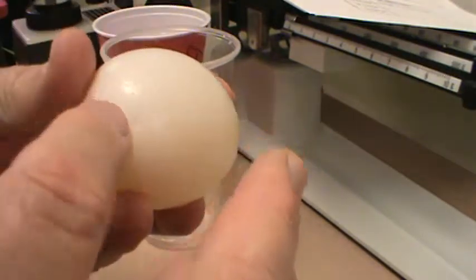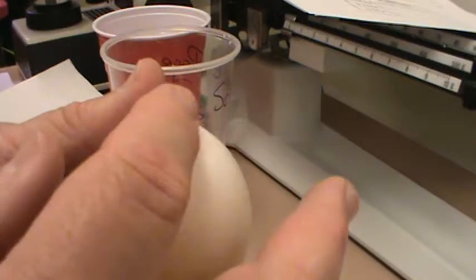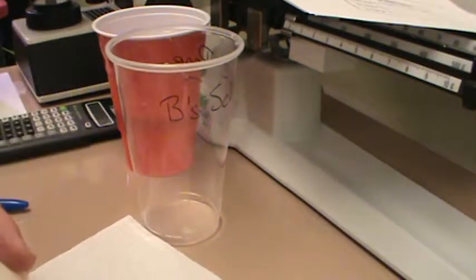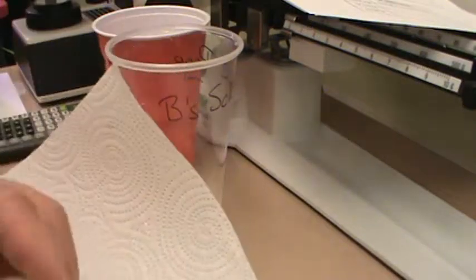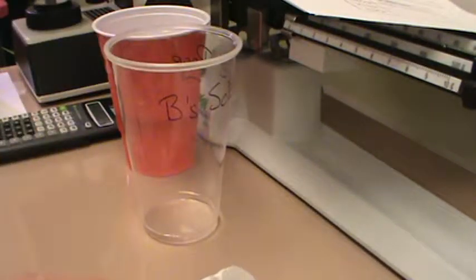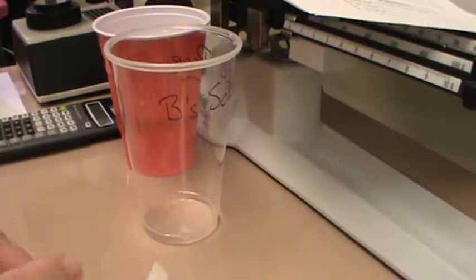Now, yesterday we still had this hard spot on the egg. I don't know if you can see that very well, but we have this nice hard spot where the shell never really did get off. Yesterday in several classes I put our eggs for each class up in front of our projector and candled the egg. That's a process called candling when you put it in front of a bright light.